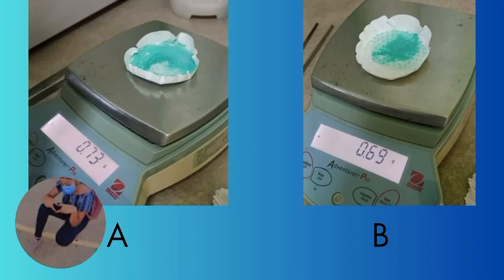The effect that is expected on the student's determination of percentage yield is that pouring too fast, the mixture accidentally bypasses the filter paper, or loss of precipitate, which lowers the actual yield. This is all the analysis questions that I have answered. Thank you.